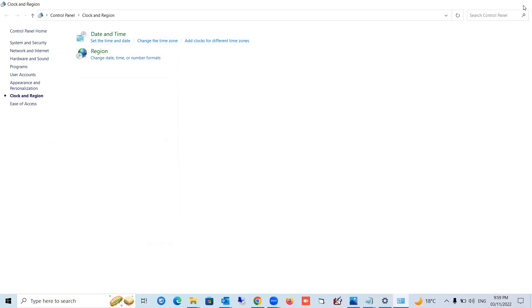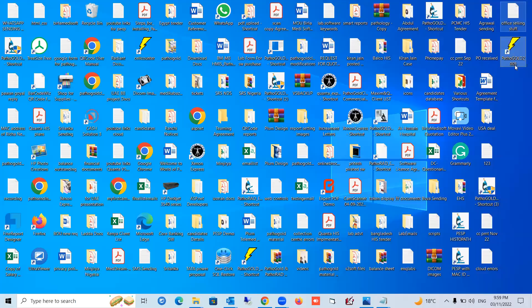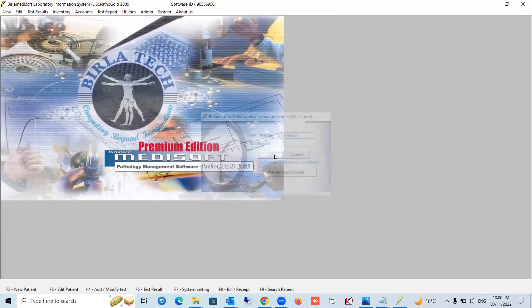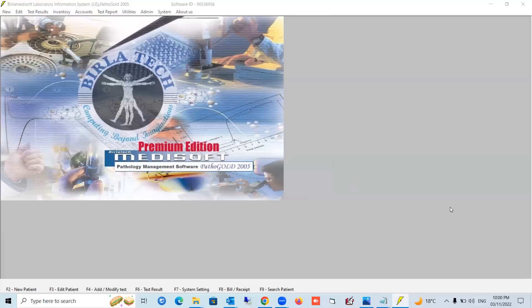Now you are all set and can start the software. Double-click the icon and press Yes when prompted. Here is the login screen. The username is 'birlatech' — spelled B-I-R-L-A-T-E-C-H — and the password is 'bt', all in lowercase. Press OK. Your software is now installed and running properly.